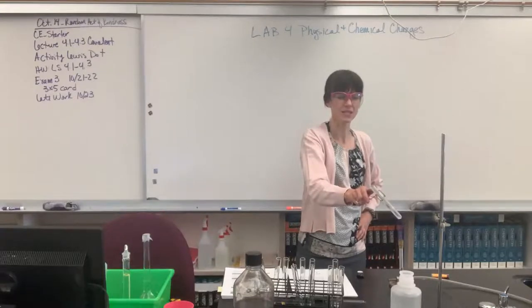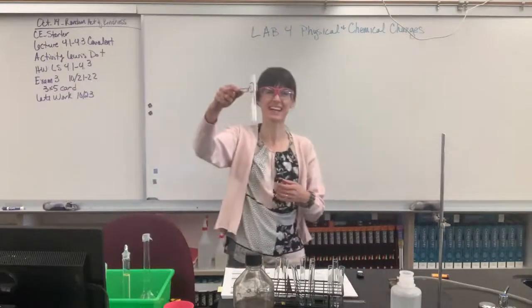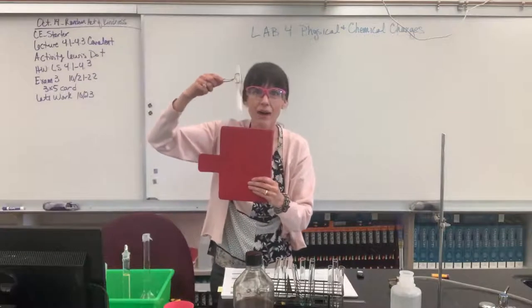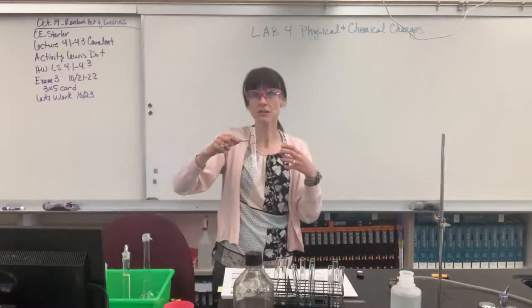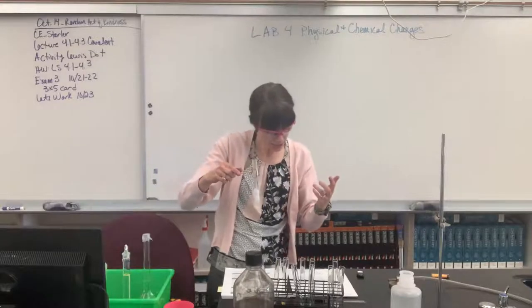Oh, and interesting, it's starting to get kind of a white foam around the bottom. So cool. Check that out, you guys. Let me show you again. So that is white. Wow. Look at that, how white that is. So we recovered the solid. Remember, I had the sodium chloride in it, dissolved it in water, heated it up.